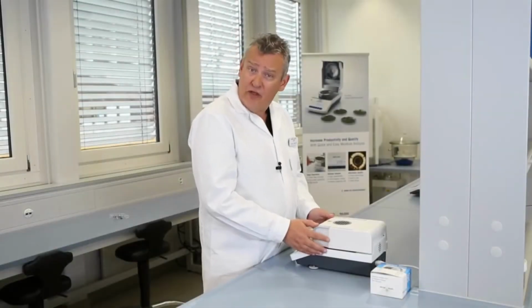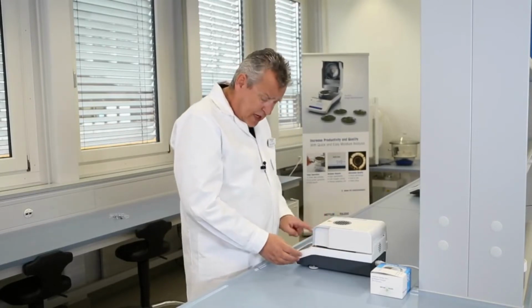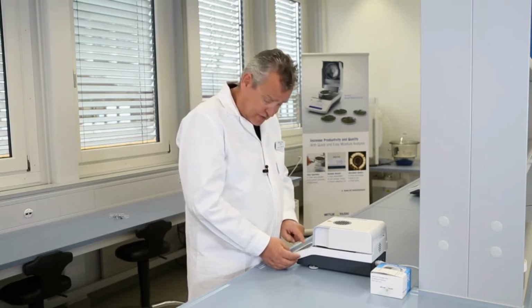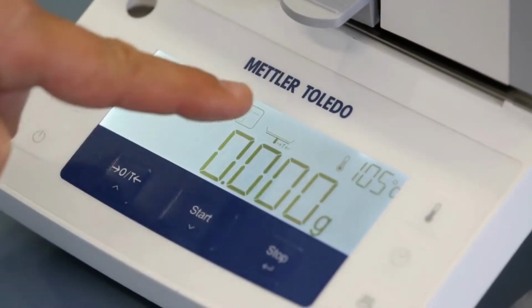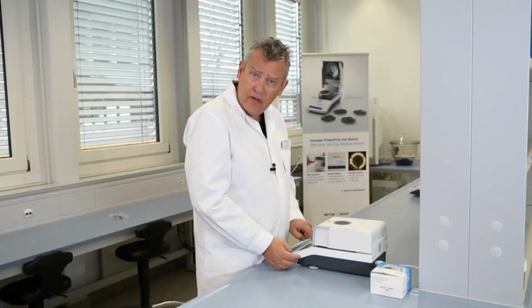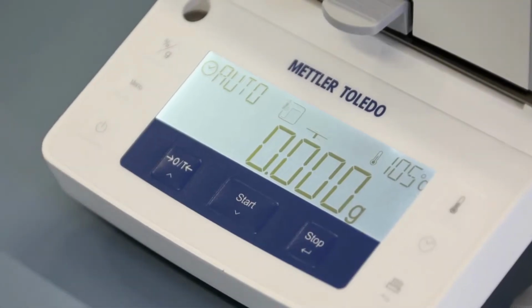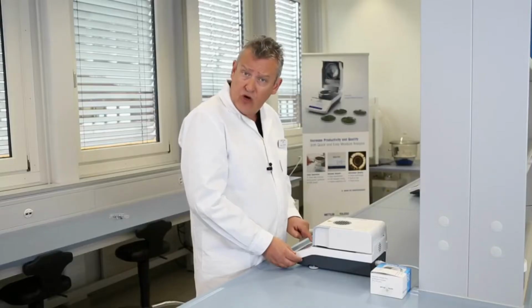Let's perform our first measurement with the HE53. You now see the active measurement parameters. These are the factory settings: 105 degrees centigrade drying temperature, standard drying program, and automatic switch-off criterion. Let's perform a measurement of potato crisps. Take a look at the icons on the display which guide you through the drying process.